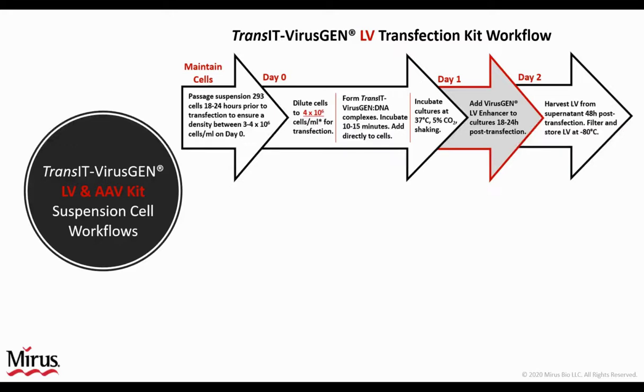18 to 24 hours post-transfection, add the LV enhancers to the culture at 10% of the total culture volume. At 48 hours post-transfection, harvest the lentivirus from the supernatant and assay as desired.